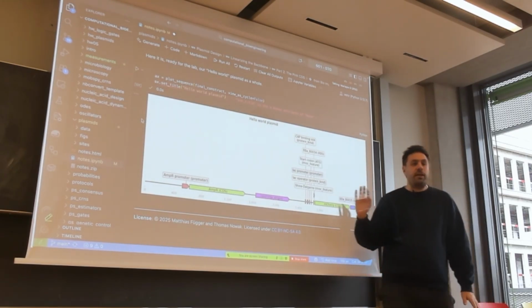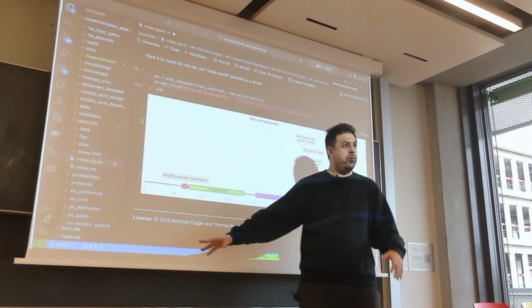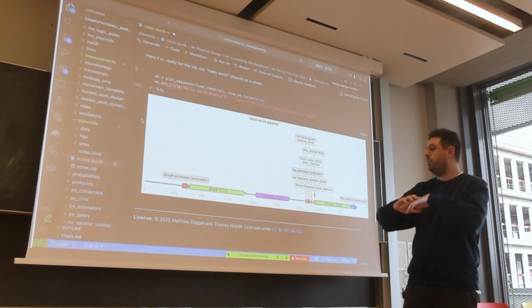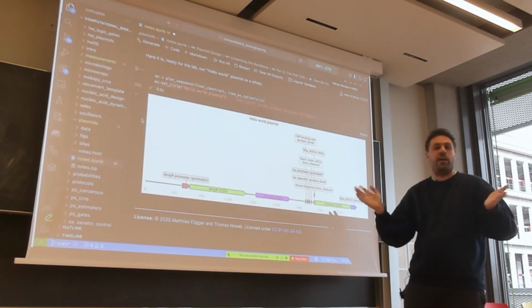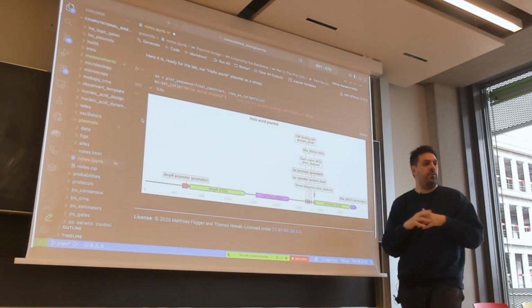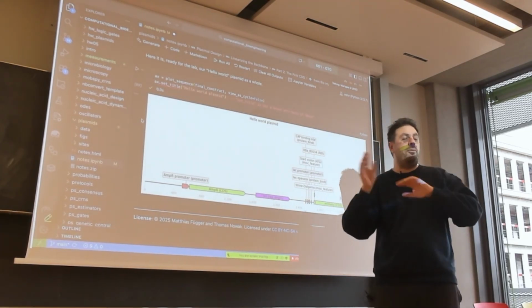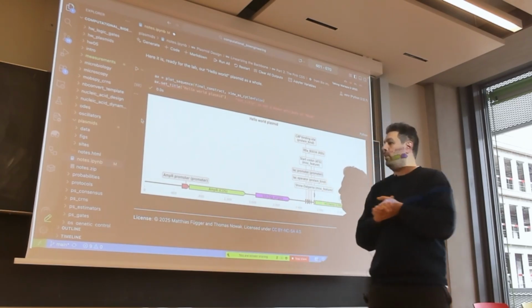Of course, again, you can run tons of verification code here. I didn't do this here, for the lecture purposes. But you can check, is the MR still here? Is the plasmid between this and this size? Do we have additional start codons from here to here or something? You can do all these checks automatically here, and not with Control F in your sequences, hoping your next colleague doesn't forget to run these checks.